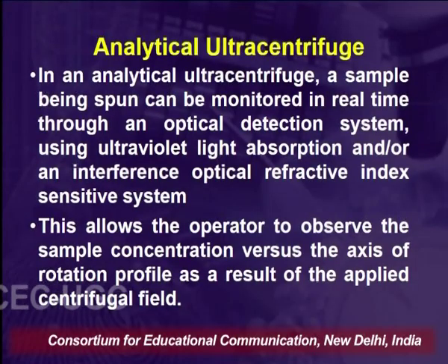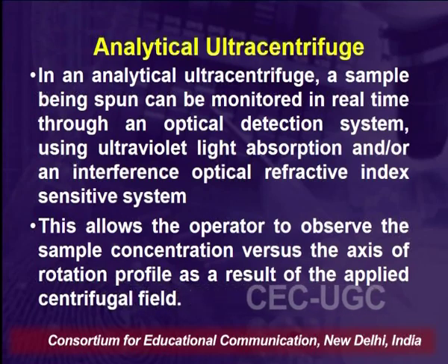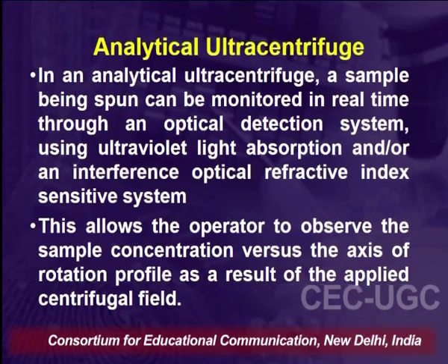We are using one absorption detector system and one centrifuge, and then we are looking at how the particles are behaving when we are using this analytical system. This system allows the operator to observe the sample concentration versus the axis of rotation profile as a result of the applied centrifugal field.